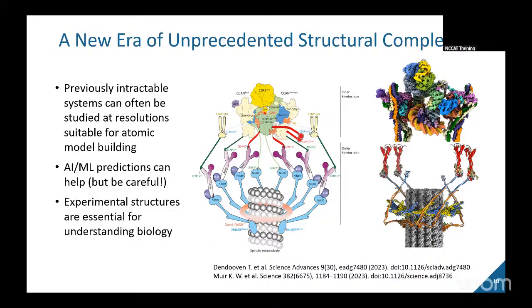And so, the PDB is helping us move beyond these single domain crystal structures to very massive, dynamic complexes. And because crystallization is not required, you have the molecular motion preserved in the vitreous ice, that gives access then to the full range of conformational states.